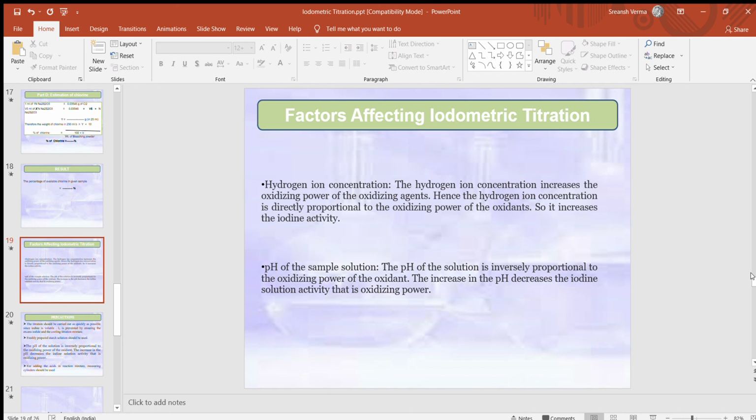Proceeding with chlorine in the titration will lead to wrong results. That is why we have replaced the chlorine and performed iodometric titration. Iodine is also volatile in nature, but in comparison to chlorine, it is less volatile. And as the size is bigger in comparison to chlorine, it will take more time to volatilize. So that is why we have replaced the chlorine with the iodine.